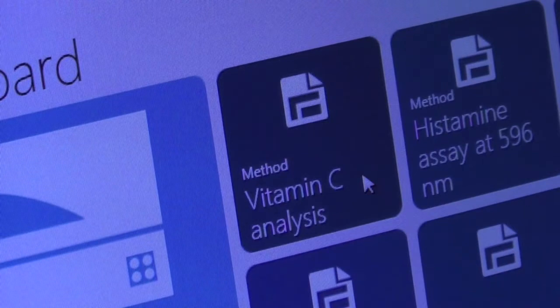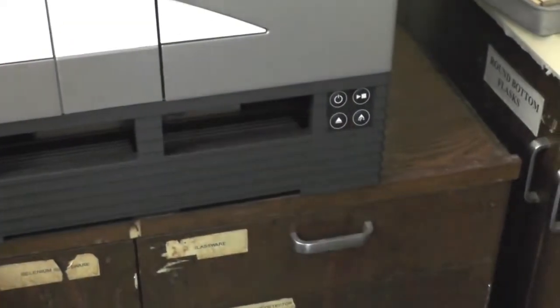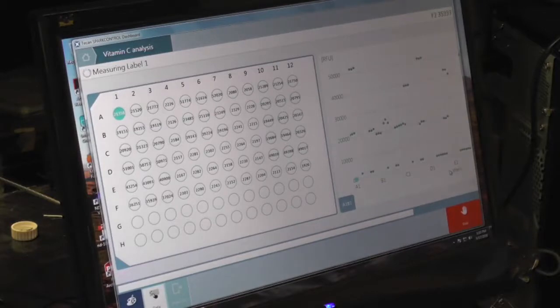After the incubation, read the plate using the preset programmed vitamin C analysis on the TICAN spectrophotometer. Save the results in excel file with session number and group number on the computer and on your USB for further analysis.